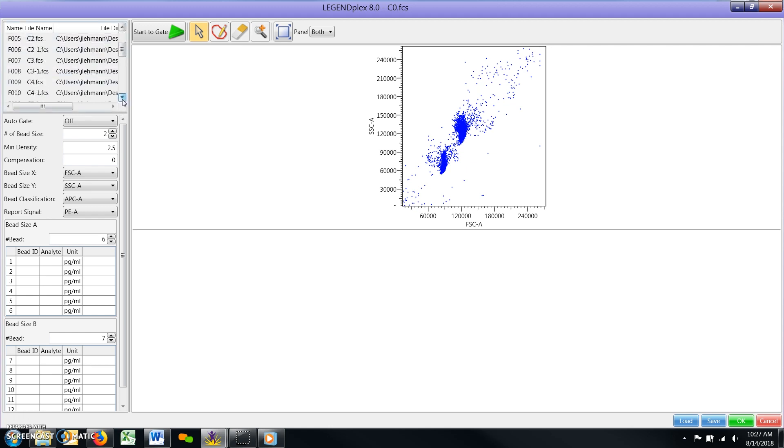Below the file list are a number of other important parameters that you will need to define prior to drawing gates for the bead populations.